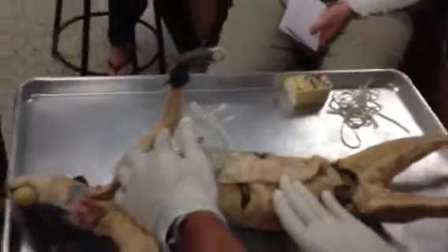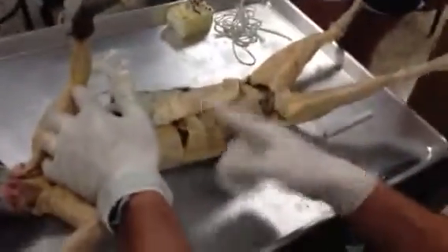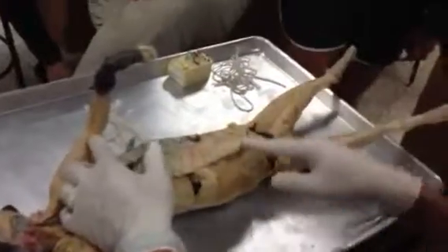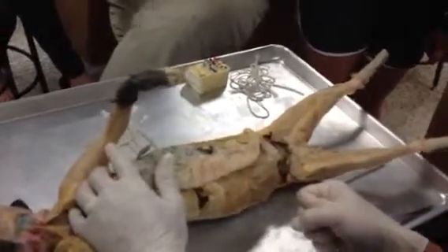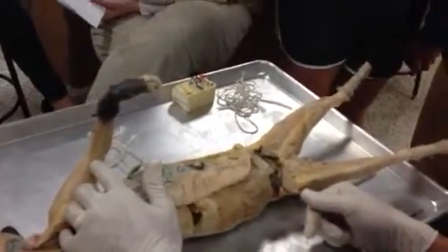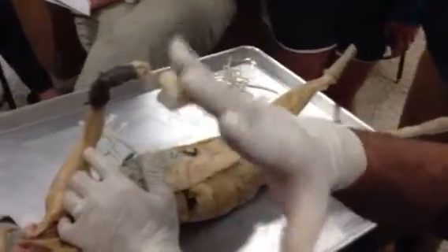Cats, mammary glands: two scenarios only, or two instances only. And when is that? She's pregnant, and when she's lactating. When she's done lactating, all of this glandular material atrophies. Atrophies. The human animal, strange animal.